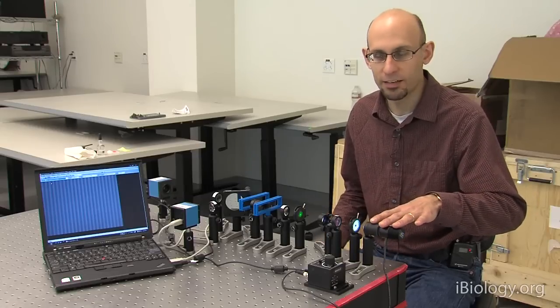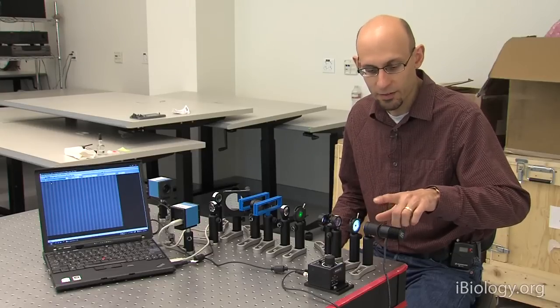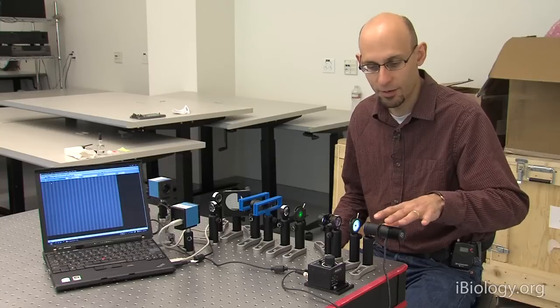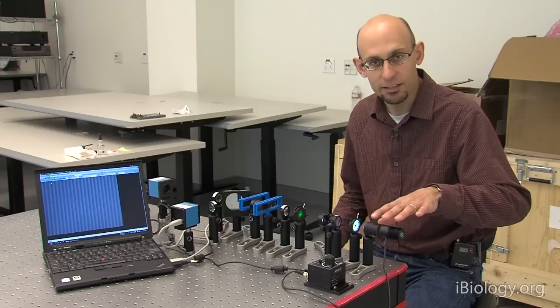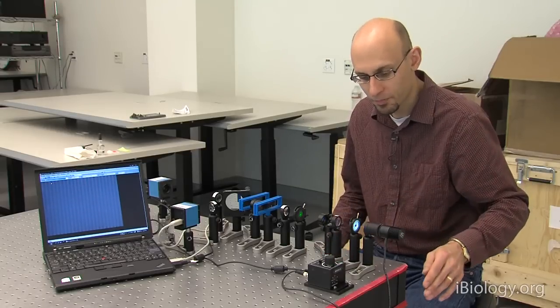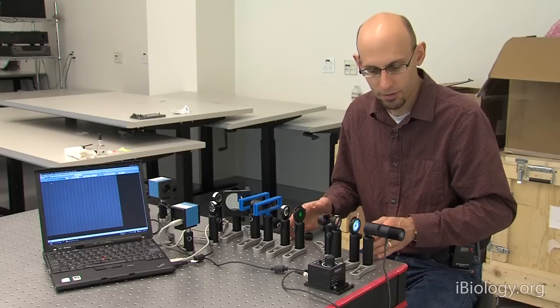So on the left here, we've got an LED light source. It's mounted in this assembly here with a collector lens. So there's a lens here that's collecting this light and focusing it out to infinity in a parallel bundle. The LED is controlled by this knob here, so we can turn it up and down, make it brighter and dimmer. And then the optics in here are the condenser optics for this microscope.